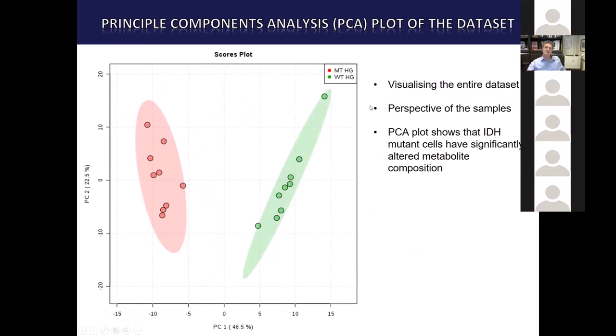So we did all those types of experiments, sample preparation and analysis. And then we took that as data, those large data sets, and we started to do some statistical analysis first. And this is a principal component plot. We use these a lot, actually. We don't use these to tell us a lot about biology, but we use them to see whether there are, in principle, biological changes that are important, and also to see how well our analysis has gone.